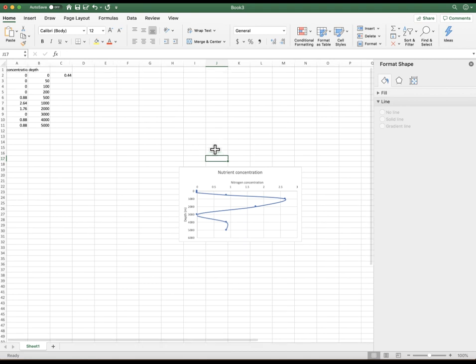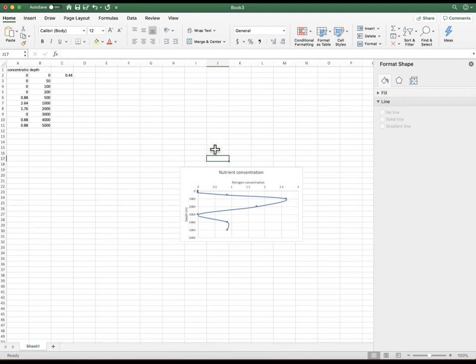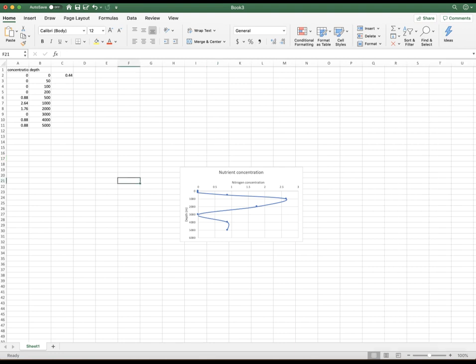Now, you have to add an additional point. And how exactly will you be doing that? The next step we do is we're going to add the additional point for the Elizabeth River surface water that you took. This may be a bit counterintuitive.